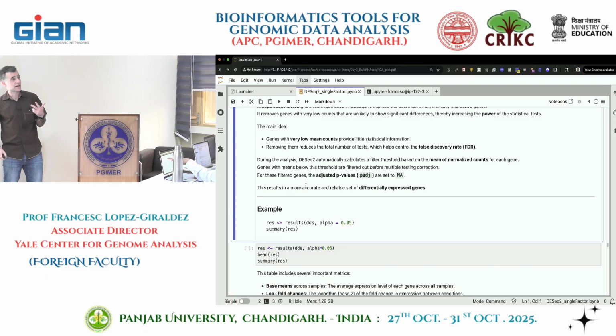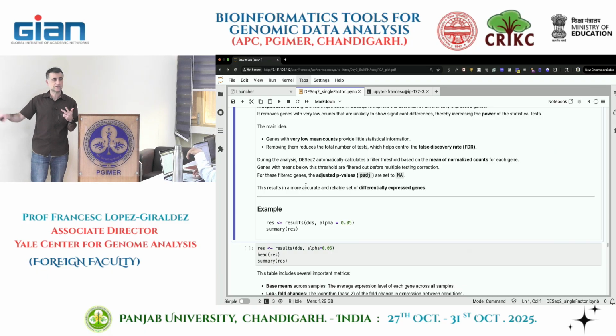So if you want to summarize, and I think I've done it at the very end, we created one object. We give to DESeq2 our data with the count data, metadata, and our formula, right? Then we ask DESeq2 to do the analysis. Actually, our third step would be access the results. With these three lines, we've done the analysis. Everything we've done between the beginning and here was just exporting the data.